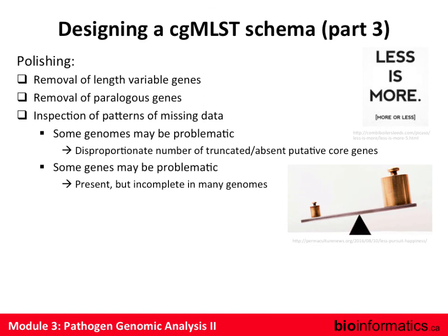Because right now, a lot of these schemes are being built by a number of different people, and not all schemes are the same. There are probably three or four schemes for Listeria as we speak, and they're not all equally good. So do be critical when you go back and start using whatever platform you're going to use for cgMLST analysis.